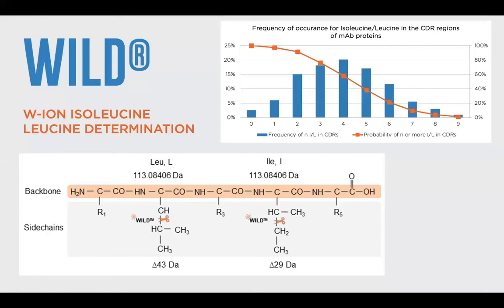And then once you have that sequence that's confirmed, that's been expressed, it is active, it is binding, then you already have a sequence there. So that immortalizes it for your research forever. And that means that you have reproducible results. The results can be reproduced by anybody absolutely anywhere, because you have that sequence information absolutely forever.